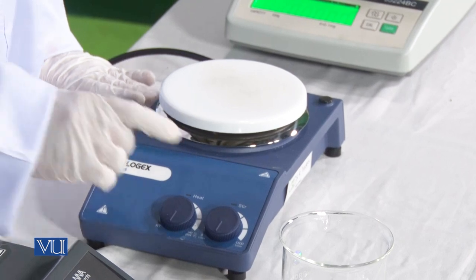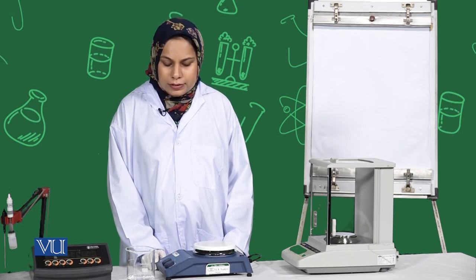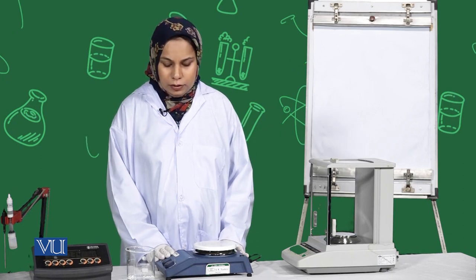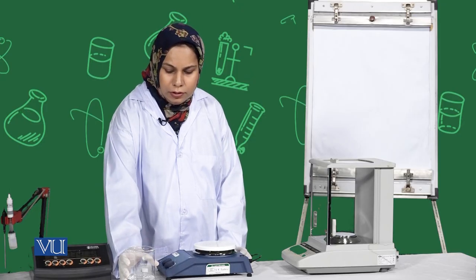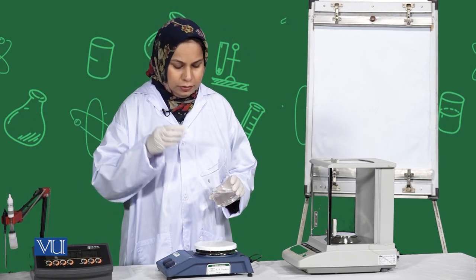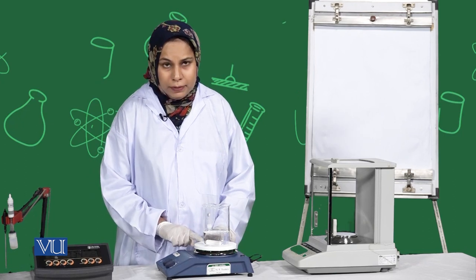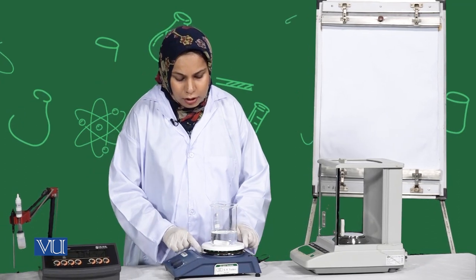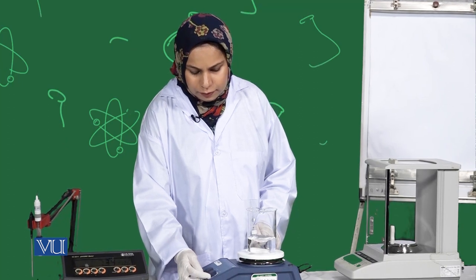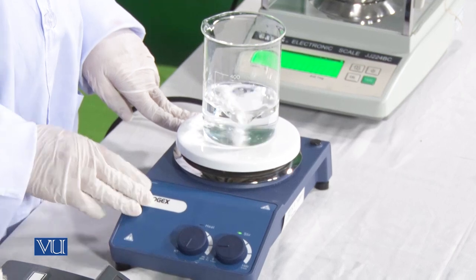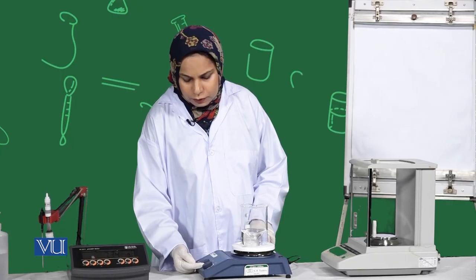This is a magnetic stirrer, also called a hot plate. Magnetic stirrers come in different dimensions and models — some are digital, some have a heating function. This magnetic stirrer has two functions: stirring and heating. Whenever you need to mix something, you need to add a magnet, avoid splashes, and put your container on the plate. The plate has a magnetic field which allows the magnet to stir. You can adjust the speed as required. You can also adjust the temperature as needed.